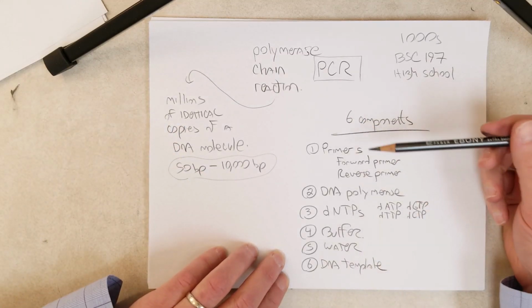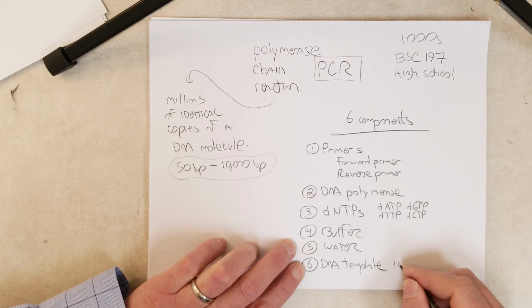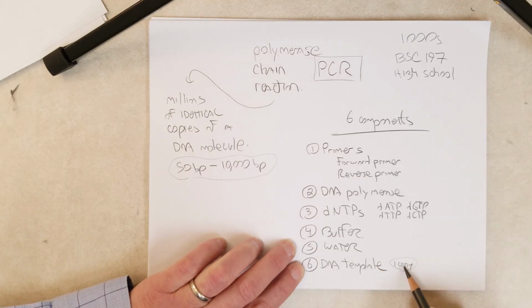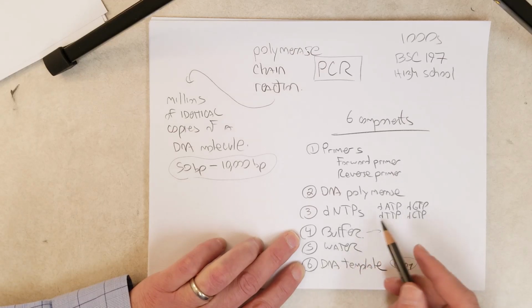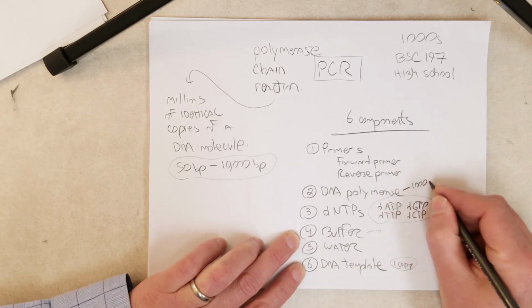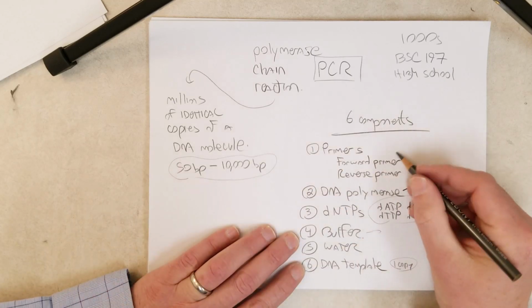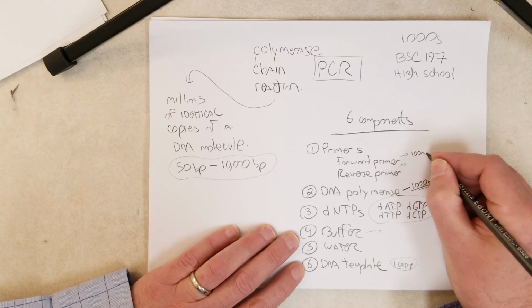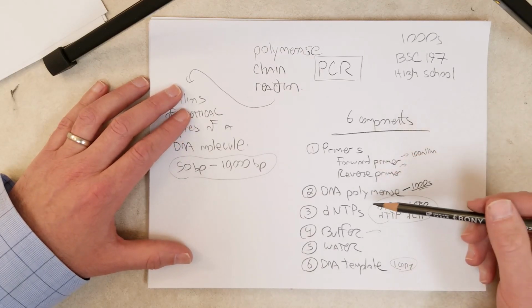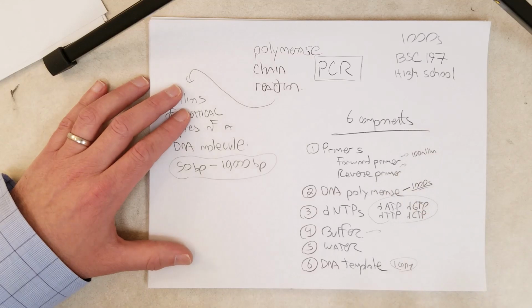So in the reaction, scientists have worked out the optimum concentrations of all of these things already. For the DNA template, you need at least one copy of that to start with, but usually you're probably going to start with thousands of copies. And then ideally you're going to turn those thousands into millions of copies. And the buffer, there's a certain concentration for that. For these, you're probably going to have hundreds of millions of each of these in the reaction. DNA polymerase, let's say it's probably going to be thousands of these polymerase molecules, these proteins, enzymes, in one reaction. And the forward and reverse primers, probably 100 million of each of these, or maybe more. I haven't actually worked out the concentrations for this, but I just want you to know it's not like you just have one primer molecule and one molecule of the reverse primer. You've got millions of these things in the reaction.